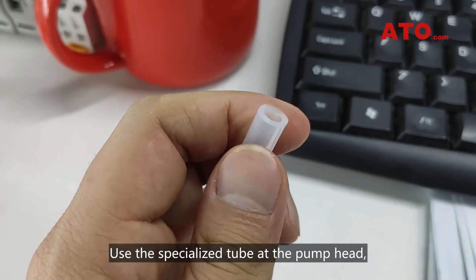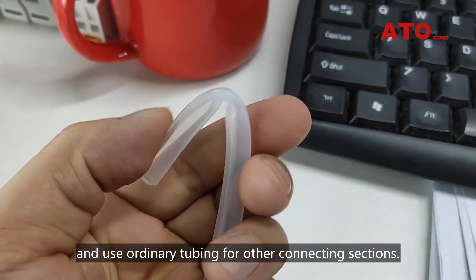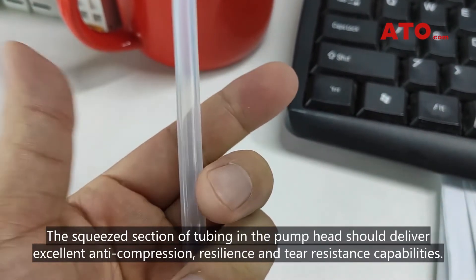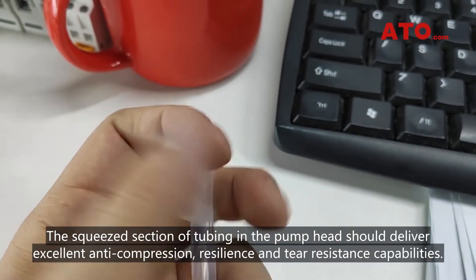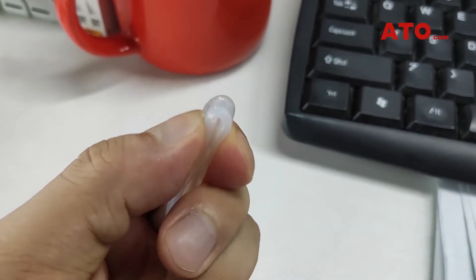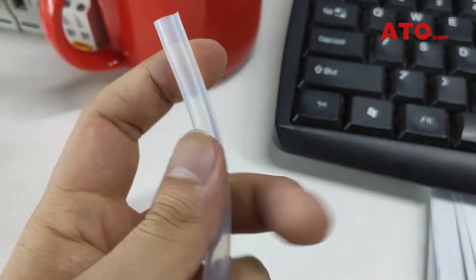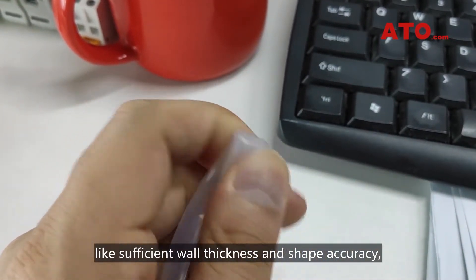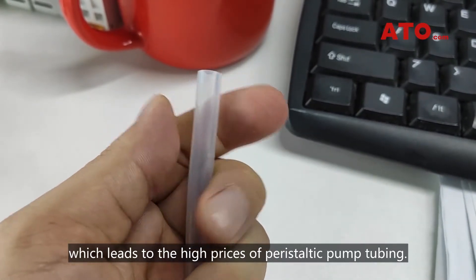Use the specialized tube at the pump head and use ordinary tubing for other connecting sections. The squeezed section of tubing in the pump head should deliver excellent anti-compression, resilience and tear-resistance capabilities. For this reason, there are high requirements for the tubing, like sufficient wall thickness and shape accuracy, which leads to the high prices of peristaltic pump tubing.